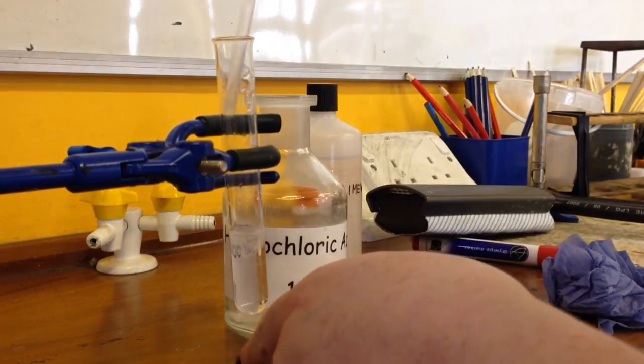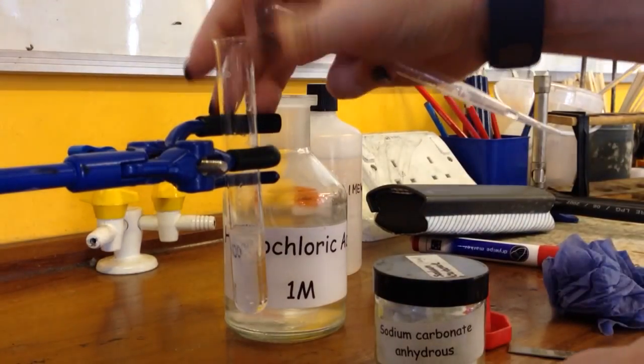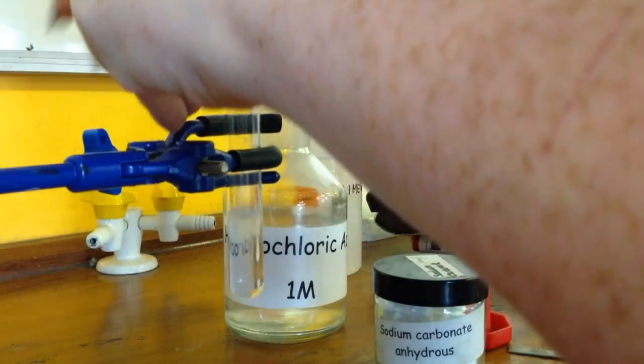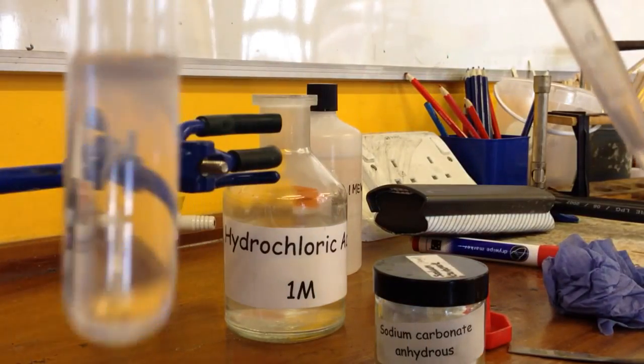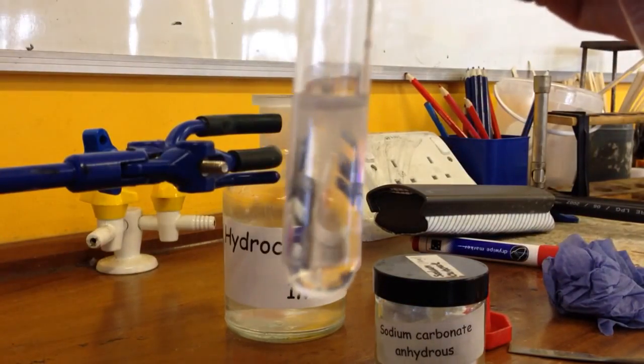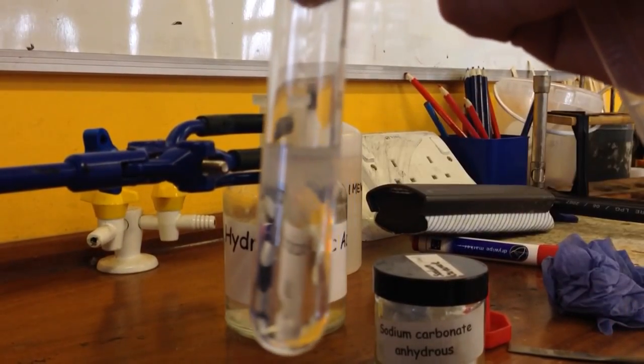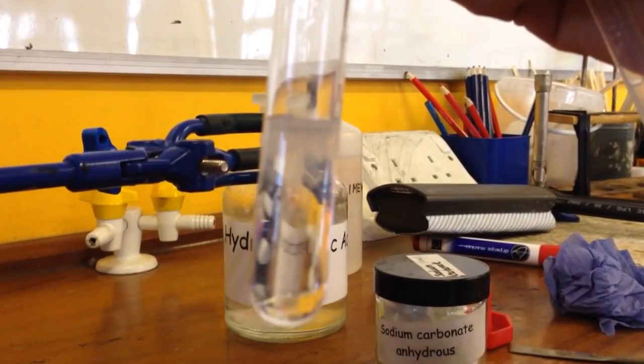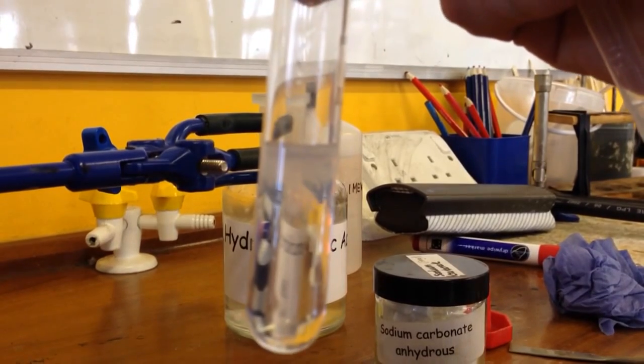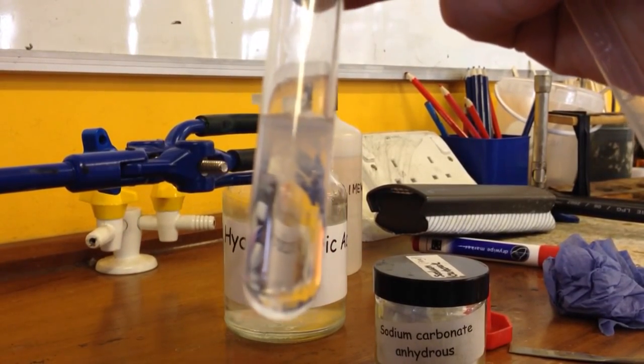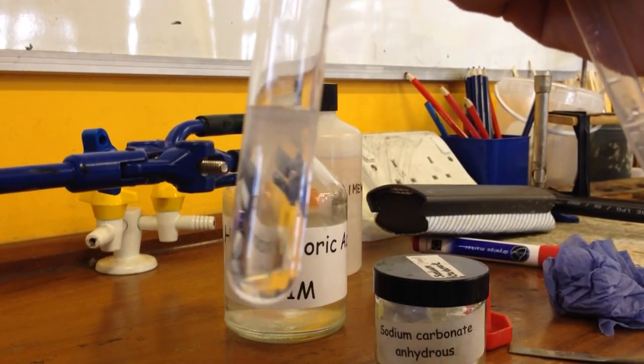Let me just unclamp that and bring it a bit closer for you. So the lime water has gone a little bit cloudy just at the top here. And that indicates the presence of carbon dioxide, and that is how we test for carbonate ions.